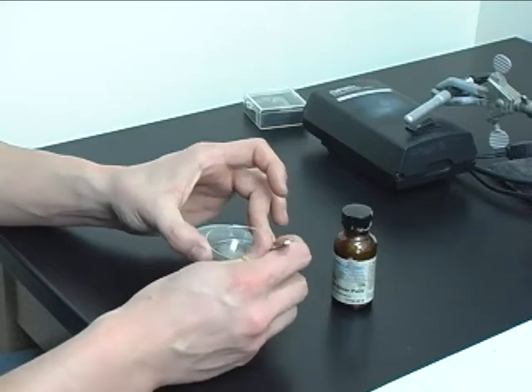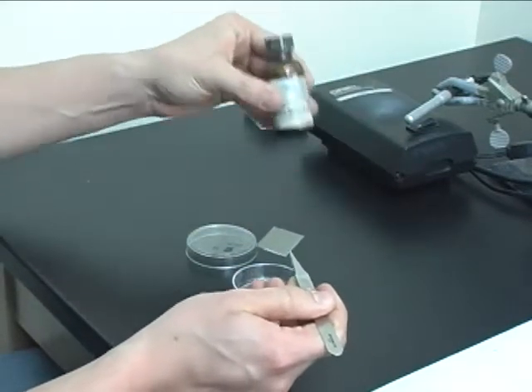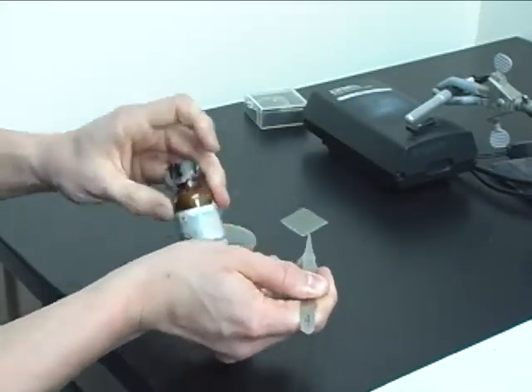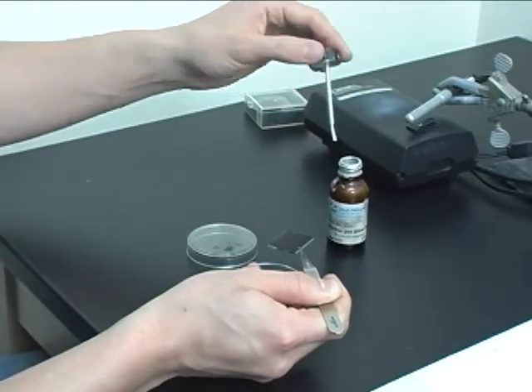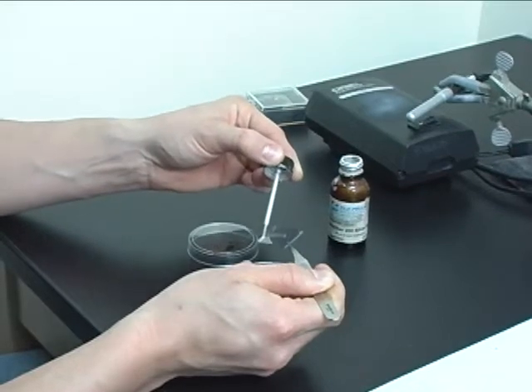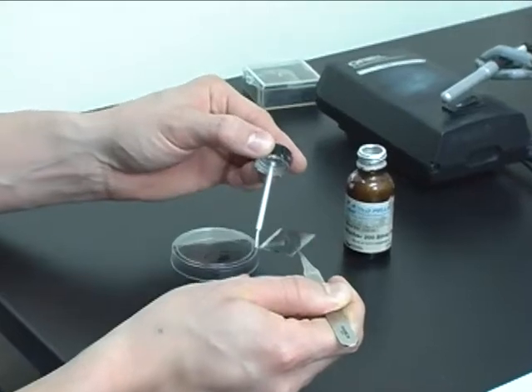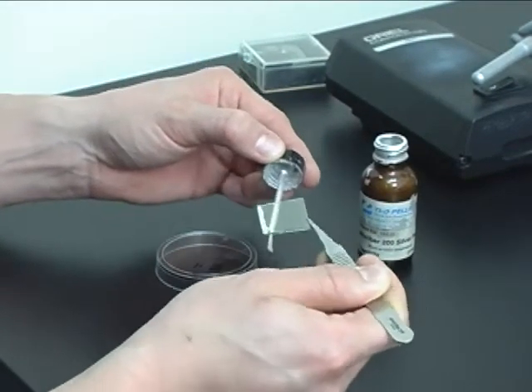And we're going to start off by painting silver paste onto the back side to make contact with our instrument. Just a little strip on the top. Make sure it goes over the sides and onto the bottom.